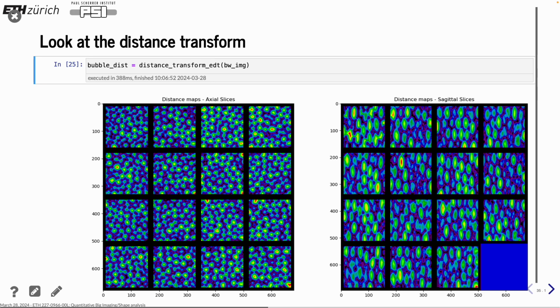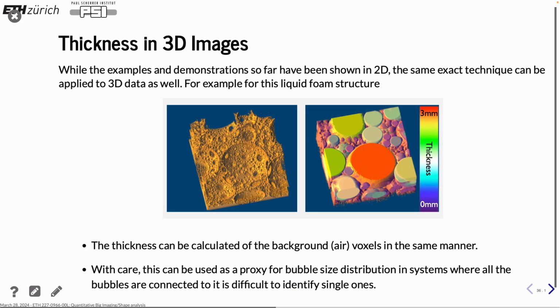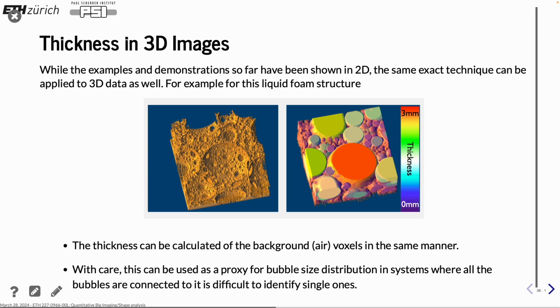Now to just compute the distance transform, we get this typical pattern that we always have some peaky points in the pore space and everywhere, and also from the side view. Now to compute the thickness map of the same, or actually this must be out of foam, also some bubble thing.